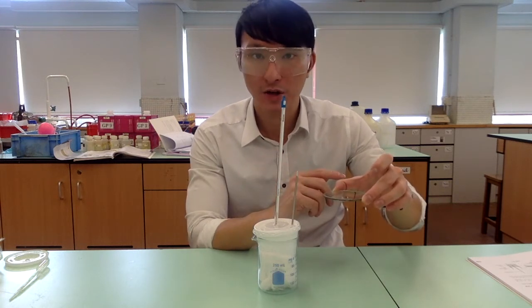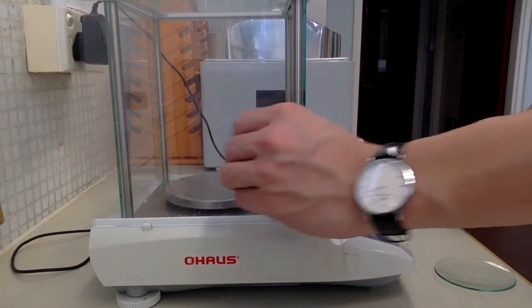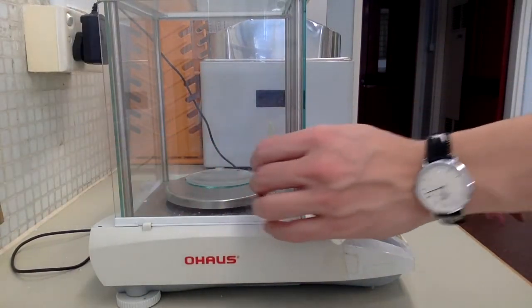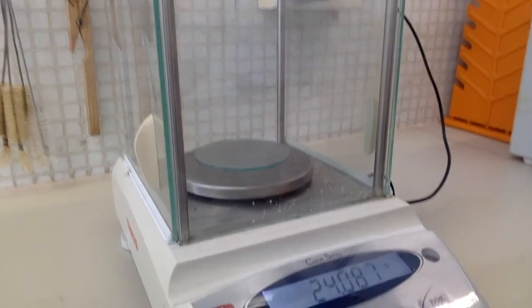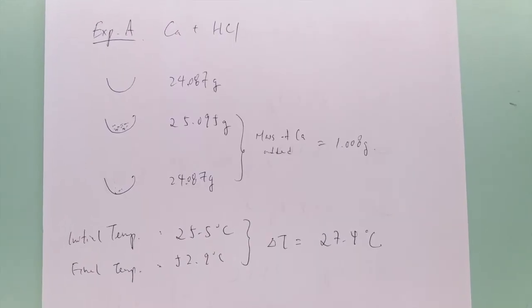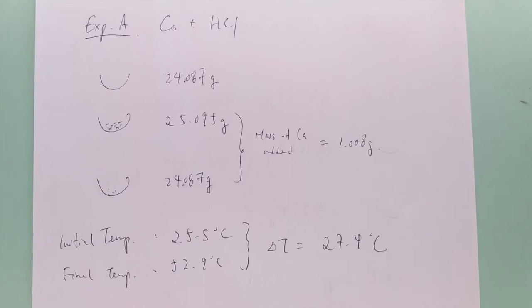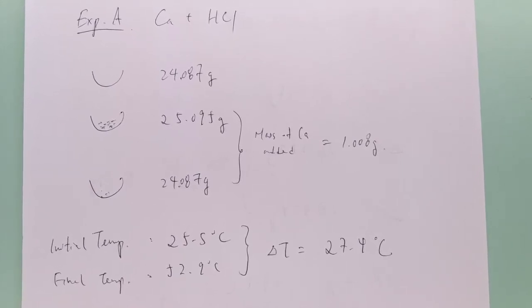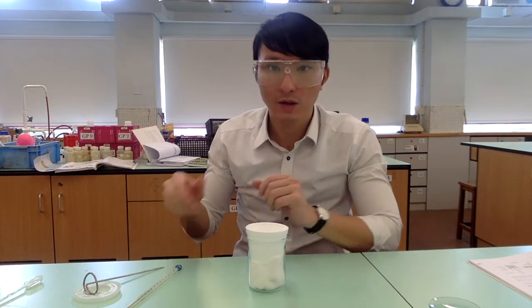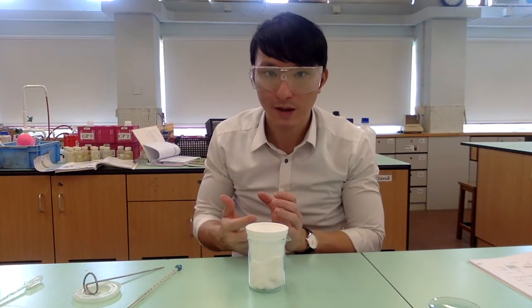So let's measure it for the last time. And then we are going to do a very similar experiment, but this time with calcium oxide.